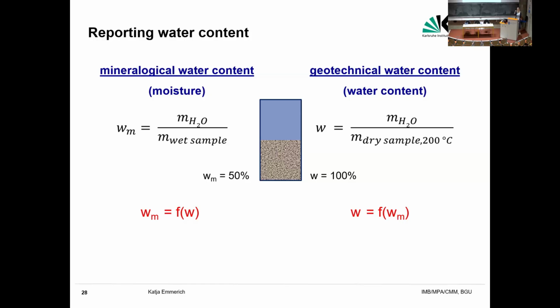And normally, if we would have more time, I would ask you to do the calculation, but now I show you how to derive the transformation equations. So here you see those values can be transformed into each other. So don't worry, just ask how your colleague calculated the water content. And if you need the other value, just transform it.